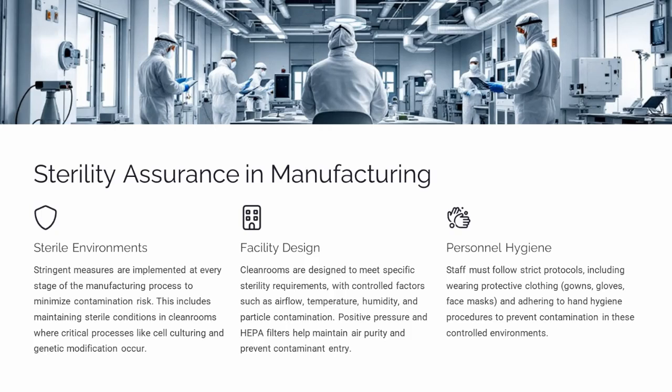Sterility assurance in manufacturing is critical. This involves maintaining sterile environments, designing facilities to meet specific sterility requirements, and ensuring personnel hygiene. These measures help prevent contamination and ensure the safety of cell and gene therapy products.